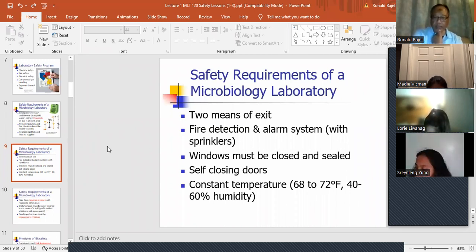And that's actually, those are the ambient conditions, but it's more for the instruments because a large change in temperature or a large change in humidity can affect your instruments and QC. You'll notice that on hot days your QC will go out of whack. So that's something to be careful about.